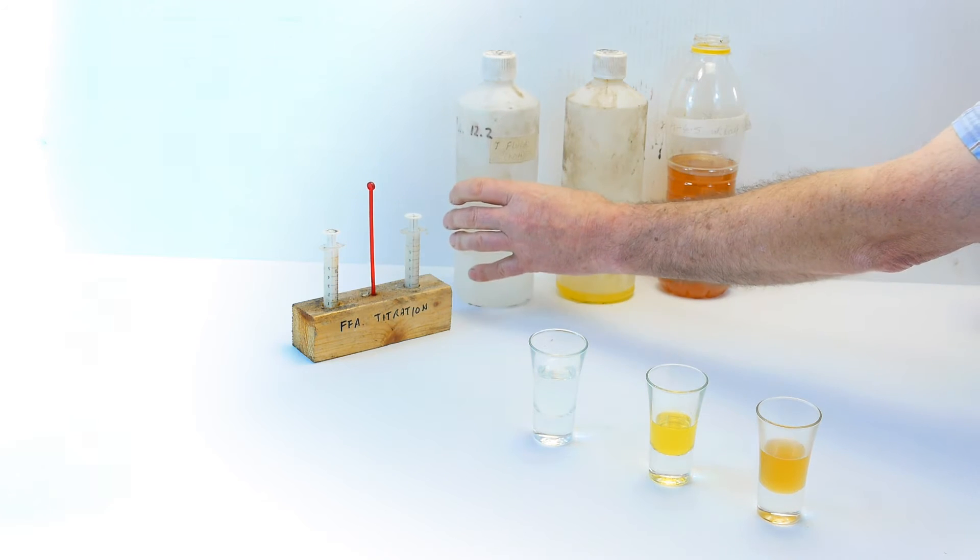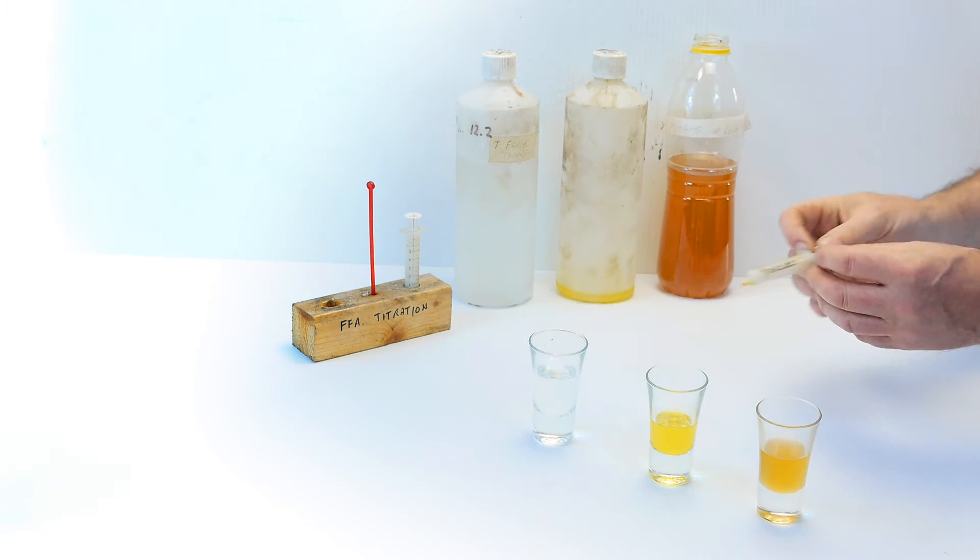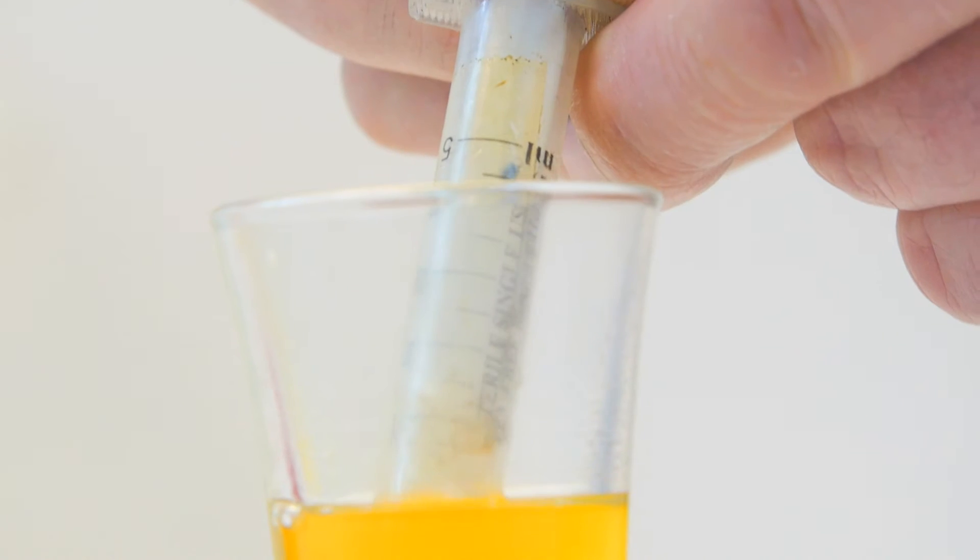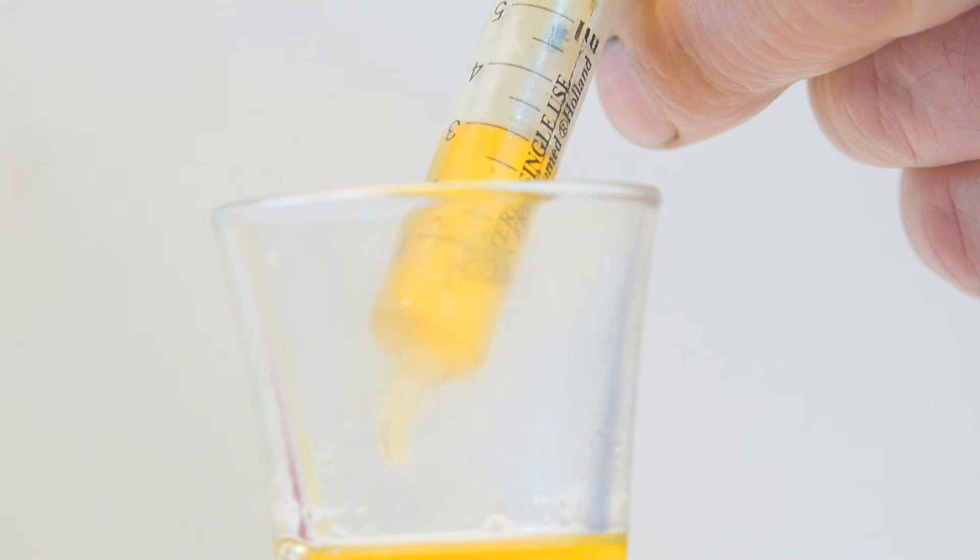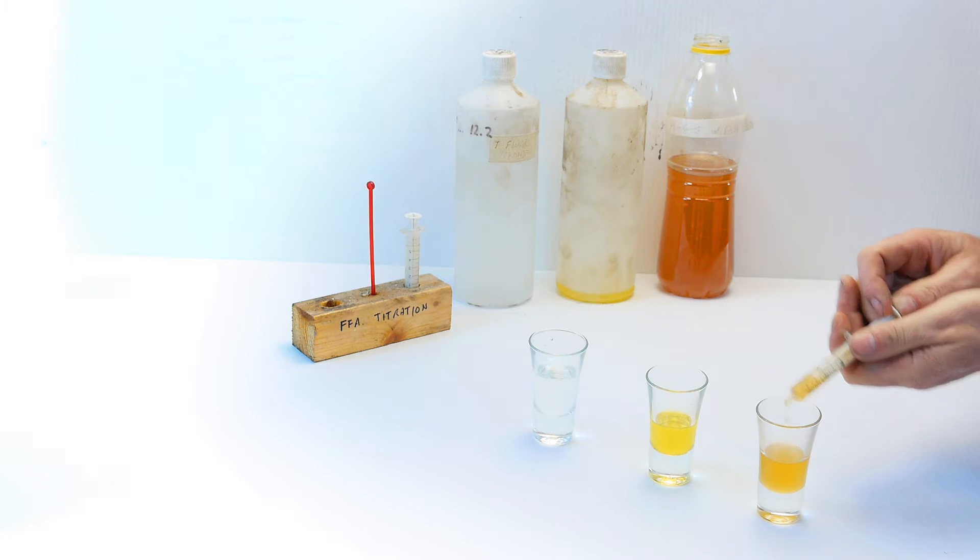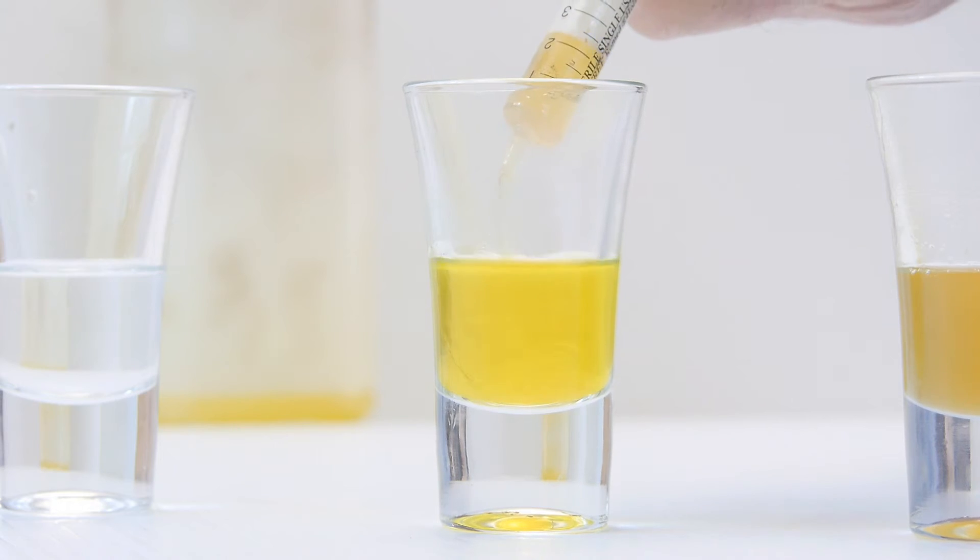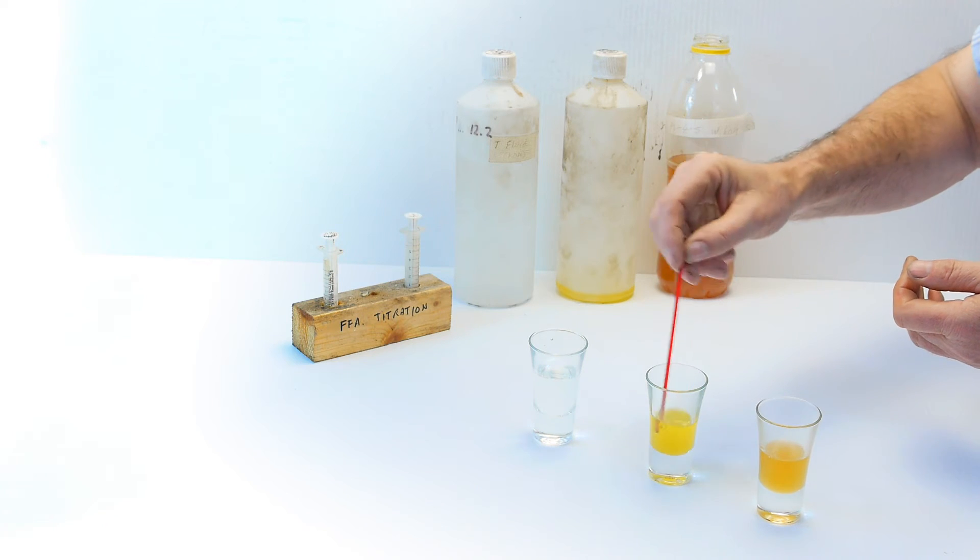Now, take the syringe marked O and fill it with oil. Take up about three milliliters and then squeeze one milliliter into the indicator. Be as accurate as you can. Give it a quick stir.